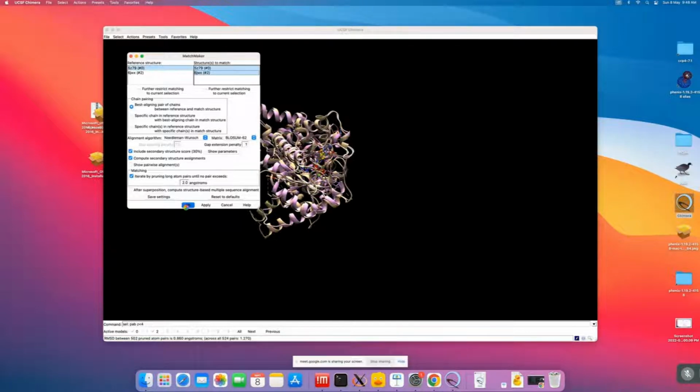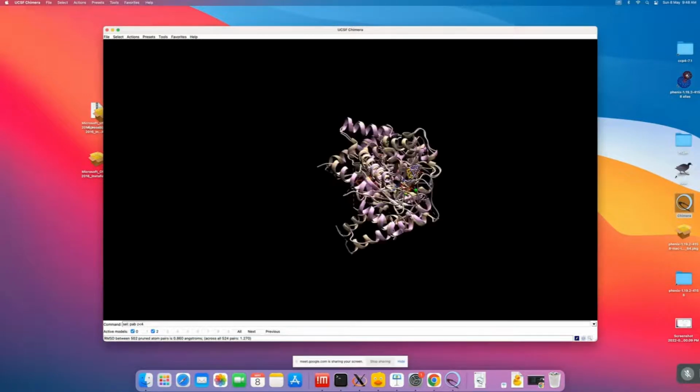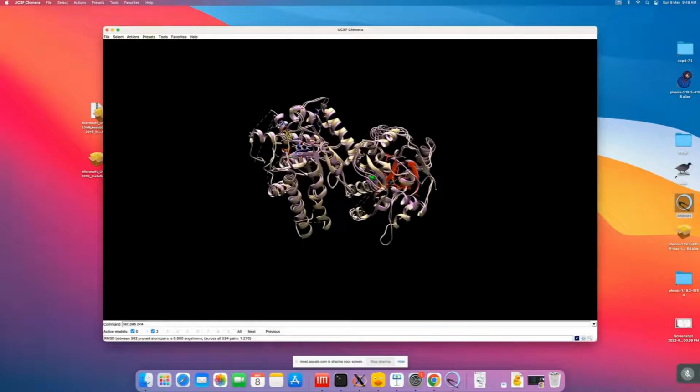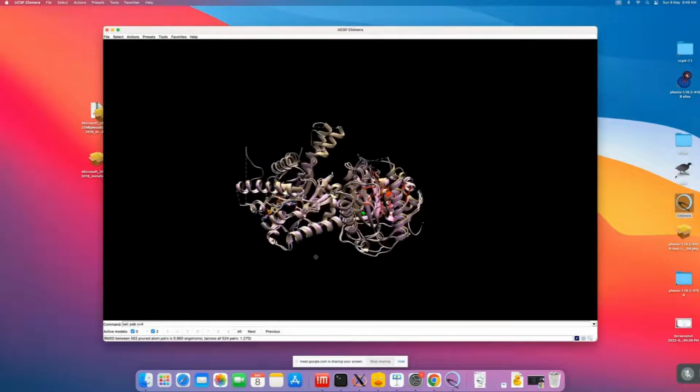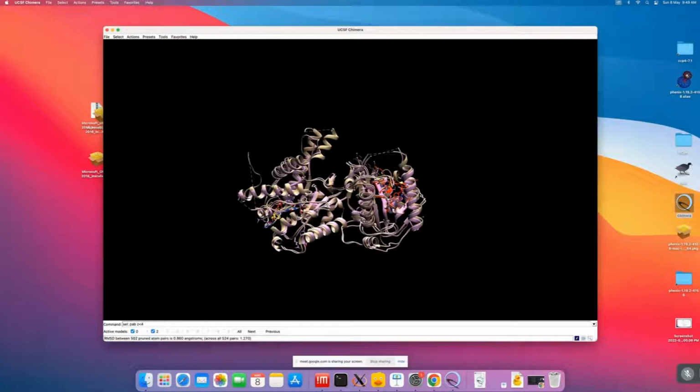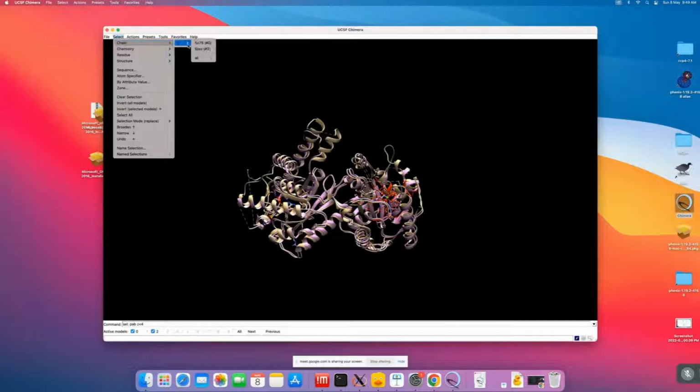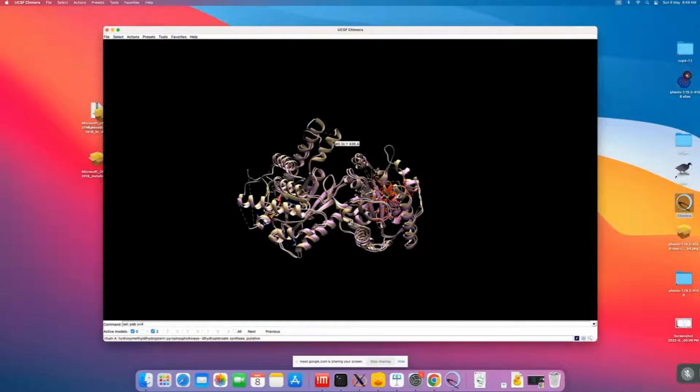Okay. So we can see that these are totally overlapped on each other, right? There are a few structural differences, but since these are same enzymes from different species, there's not much difference. However, the most striking difference which I can see over here is that there is an extended alpha helix in 5Z79, number 0 chain. You can check it from here, that 5Z79 is number 0, and 6JWX, the pink one, is number 2. So when you scroll over here, we can see that there is an extended alpha helix over here, whereas 6JWX has a loop over here, right?